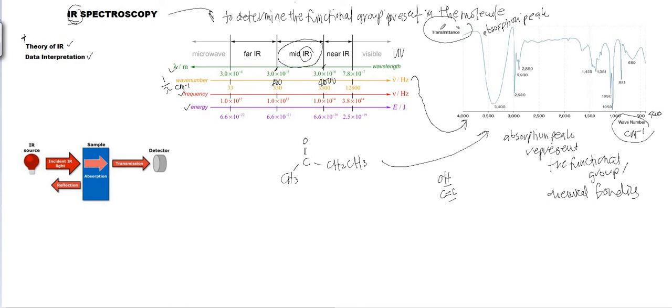But for the chemical C, after you try to do it theoretically, so you're supposed to know this is how my product is, macam kita kata macam ni lah produk yang ada apa functional group dan sebagainya. So to make a confirmation, you can go for the IR and then try to study berkenaan dengan all the absorption peak and then elucidate the structure to match with the one that you are expecting, for example. Okay, so that's the IR spectroscopy punya function lah.